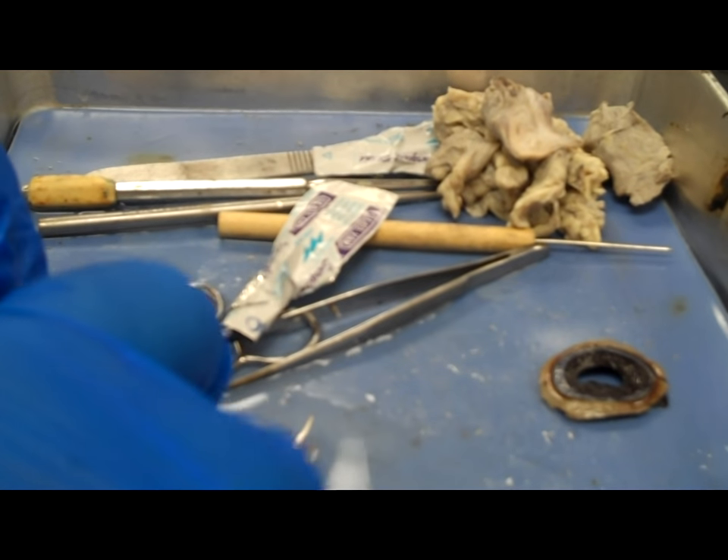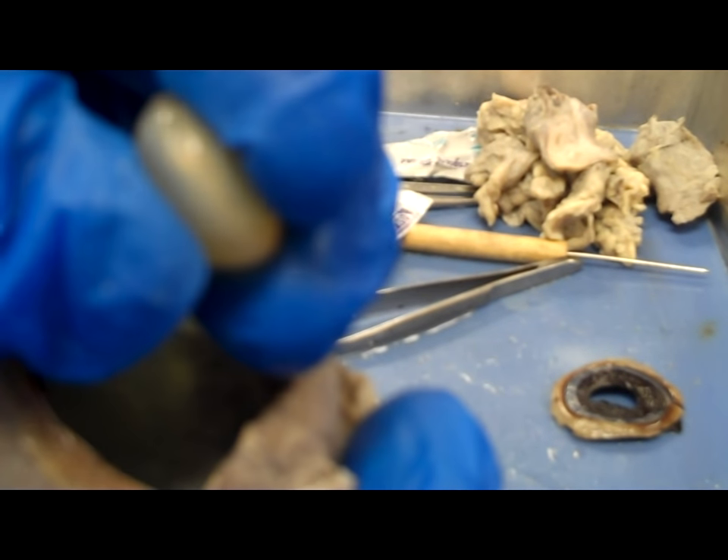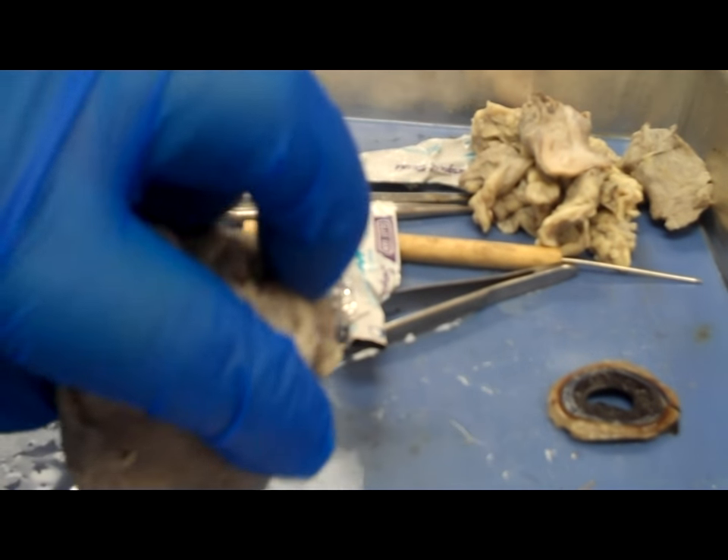The piece you're seeing me lift out now is actually the lens of the beef eye. It's very, very hard — it was really surprising how hard it was.